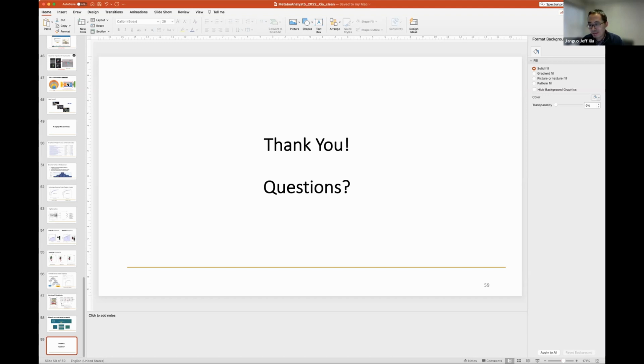Yeah. Great, thank you. The next question is on OmixNet, which was something new that I learned during your talk today. Does OmixNet use a mixOmics library? I think that's a library name. Models such as DIABLO or MINT. And the person who asked this question wonders if at some point users can integrate omics and non-omics data, such as complete blood count, for practical applications in different settings, such as hospital daily protocols. So really it's asking about the future of MetaboAnalyst and where you see it going.